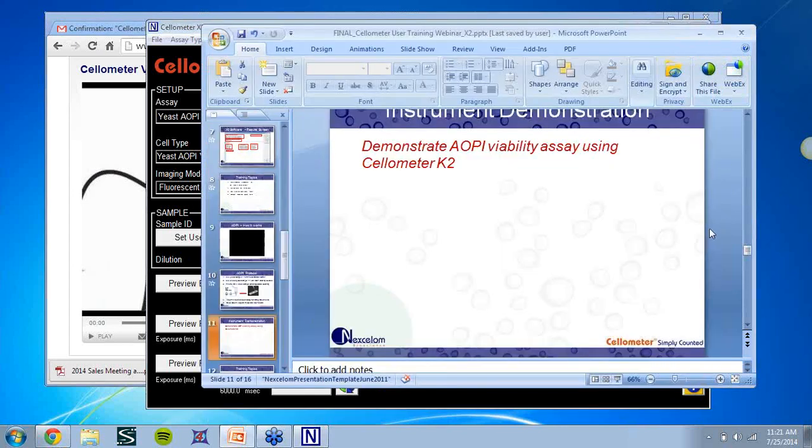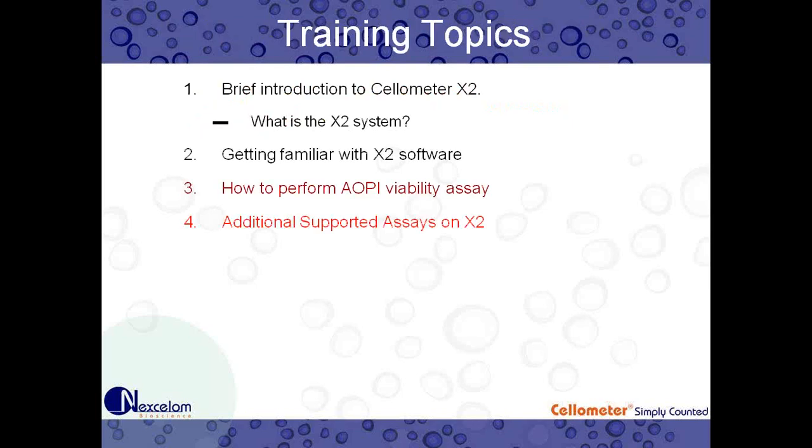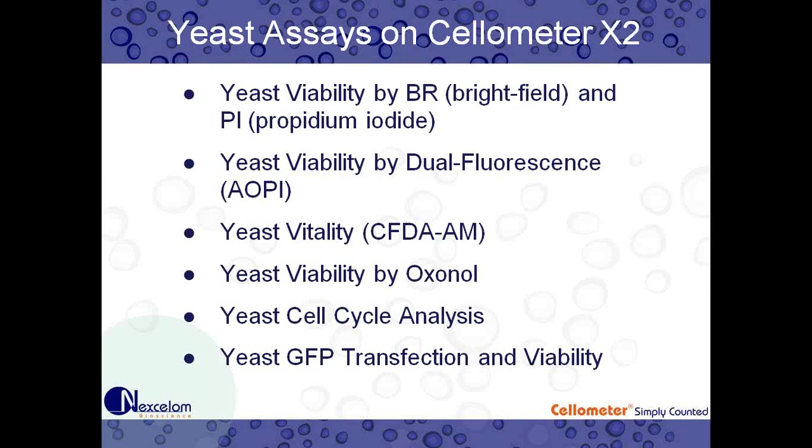So let's go back to our presentation. All right, so the final one is the additional assays that are supported on the X2, and here is a list of the complete assays that are supported on the Cellometer X2.